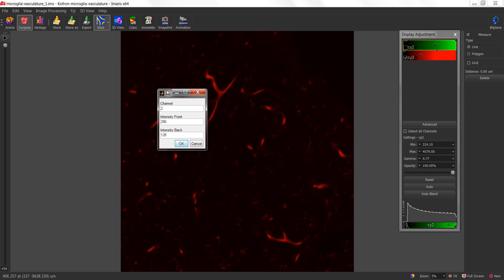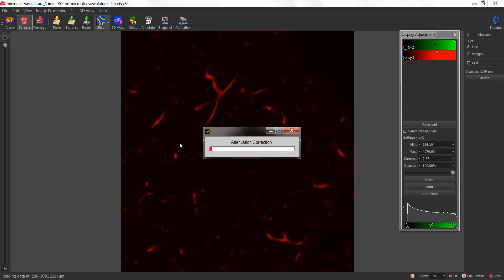It also asks for the intensity at the front of the stack versus the intensity at the back of the stack. The front of the stack for us is actually the bottom of the stack, because it's based on the numbering system on the left-hand side. The highest number would be the back of the stack, and the lowest number would be the front of the stack. So I'm going to enter in 600 gray levels for the bottom and 1,500 gray levels for the top. Once that's been entered, click OK and the attenuation correction will start to be calculated.